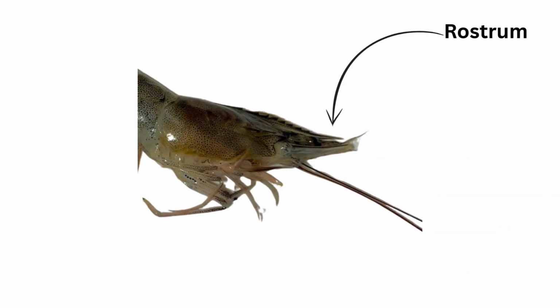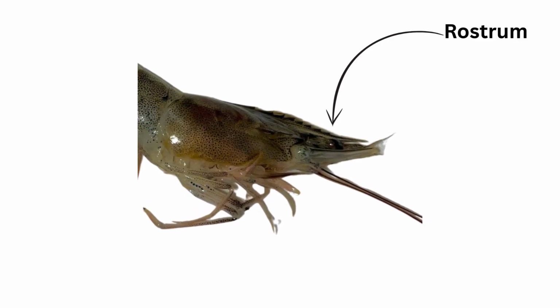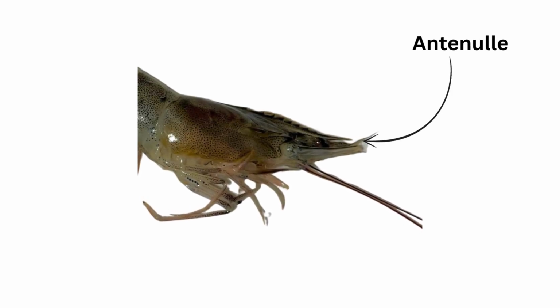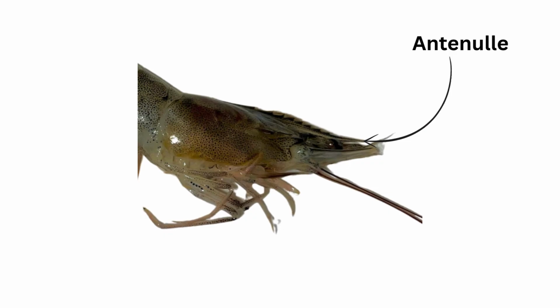Rostrum. The rostrum is a pointed beak-like extension of the carapace that projects forward between the eyes. It helps protect the eyes and sensory organs and can be used in defense or to stabilize the shrimp while swimming. Antennules. The antennules are short paired appendages near the front of the head. They are mainly used for balance and detecting chemicals in the water, helping the shrimp sense its surroundings.